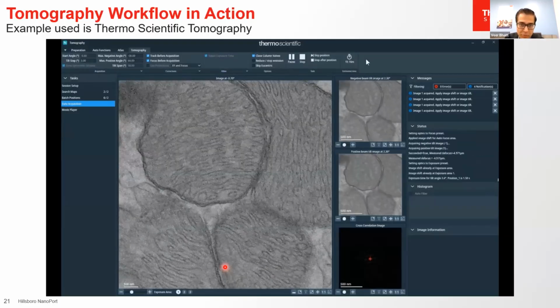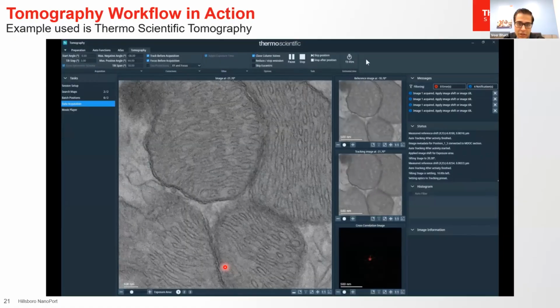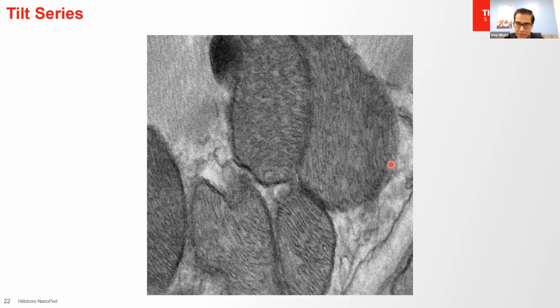I'm going to speed up the video and skip most of it, but just a quick preview of how it goes. Okay. So the tilt series is exported here.